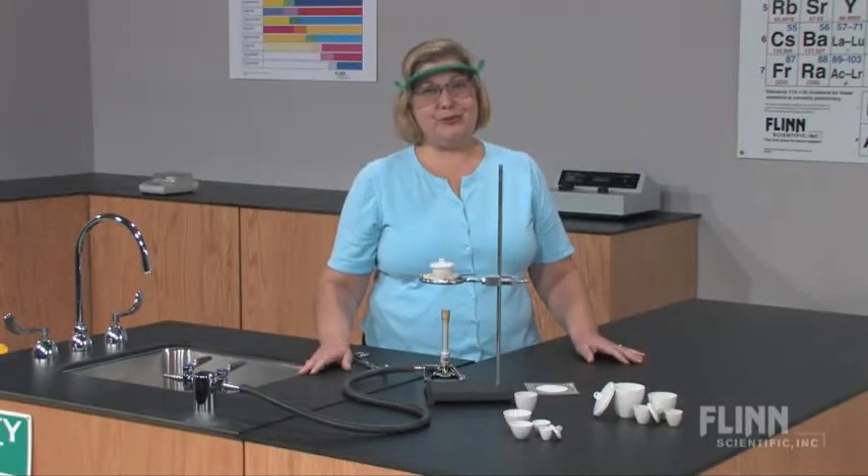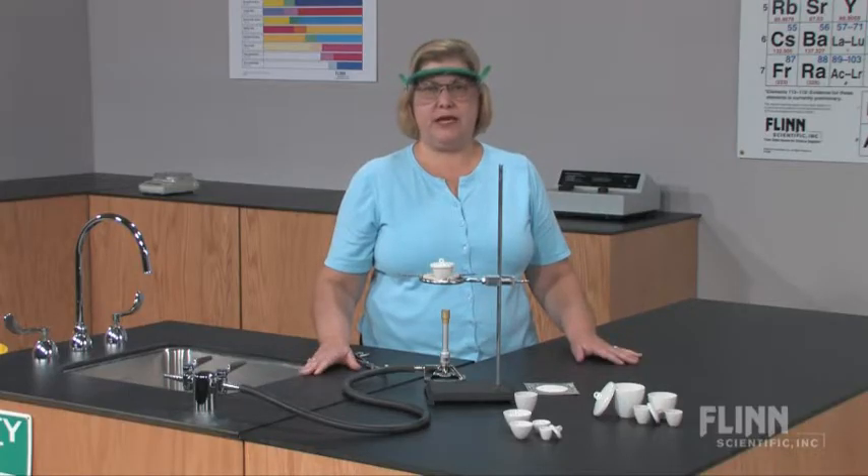Even the best crucibles will break if not used properly. To reduce thermal stress and protect against broken crucibles, teach students to always follow these simple steps.